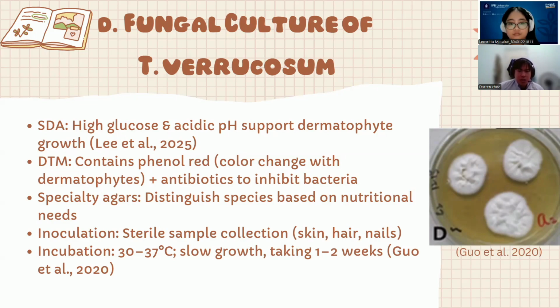It's important that we collect samples such as skin scrapings, hairs and nails sterilely to prevent contamination. And incubation takes place at about 30 to 37 degrees Celsius because it is thermophilic and grows slower, which is like 1 to 2 weeks for the full growth.